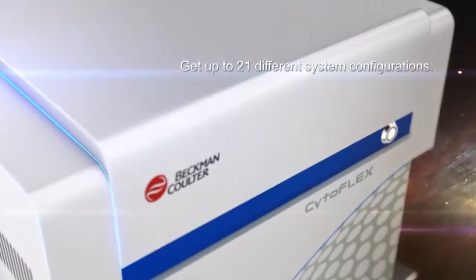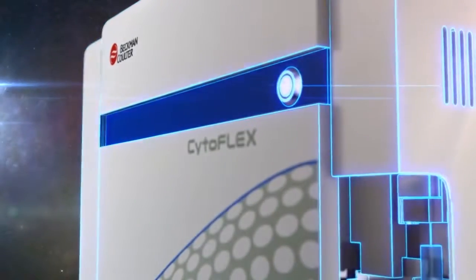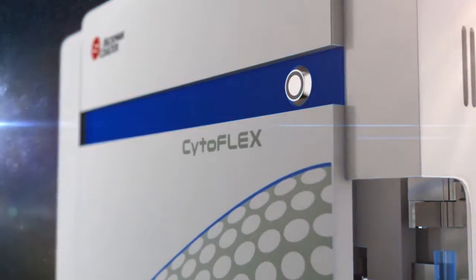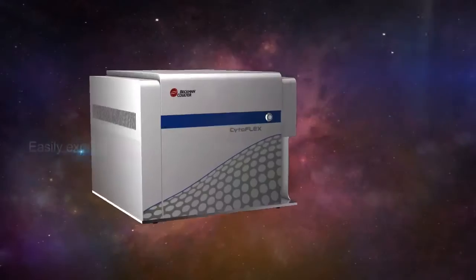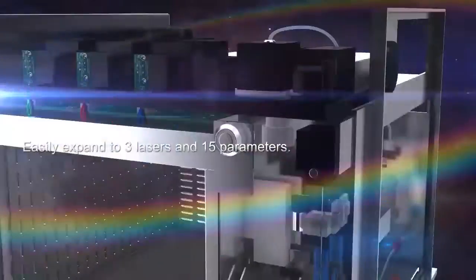With CytoFLEX, you can get the capability you need now and expand later as your needs grow. CytoFLEX is easy to upgrade with 21 different system configurations. Expand up to 3 lasers and 15 parameters as your research needs change.